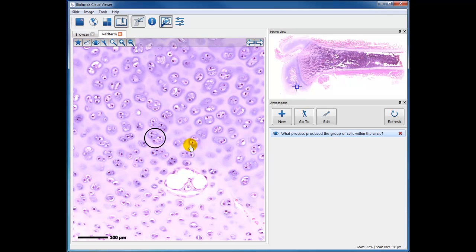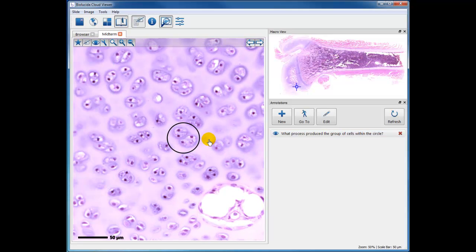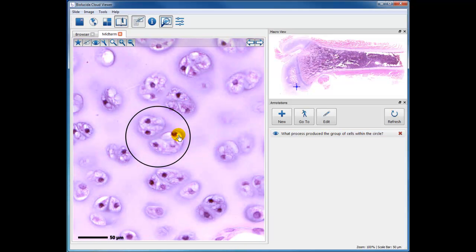So you have to think, well, what are these cells? Well, if you're stumped, then I think you have to think about what the features are here. I see dark staining round structures, which suggest to me they're nuclei. And you know all the staining, unless we tell you it's different, is H&E.